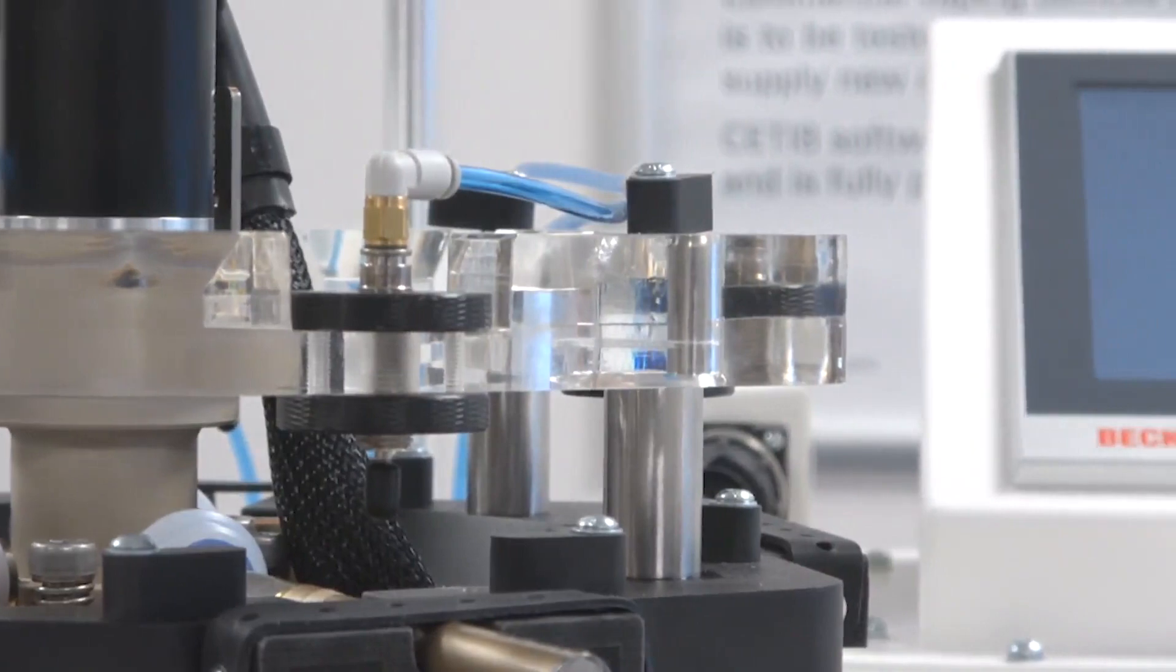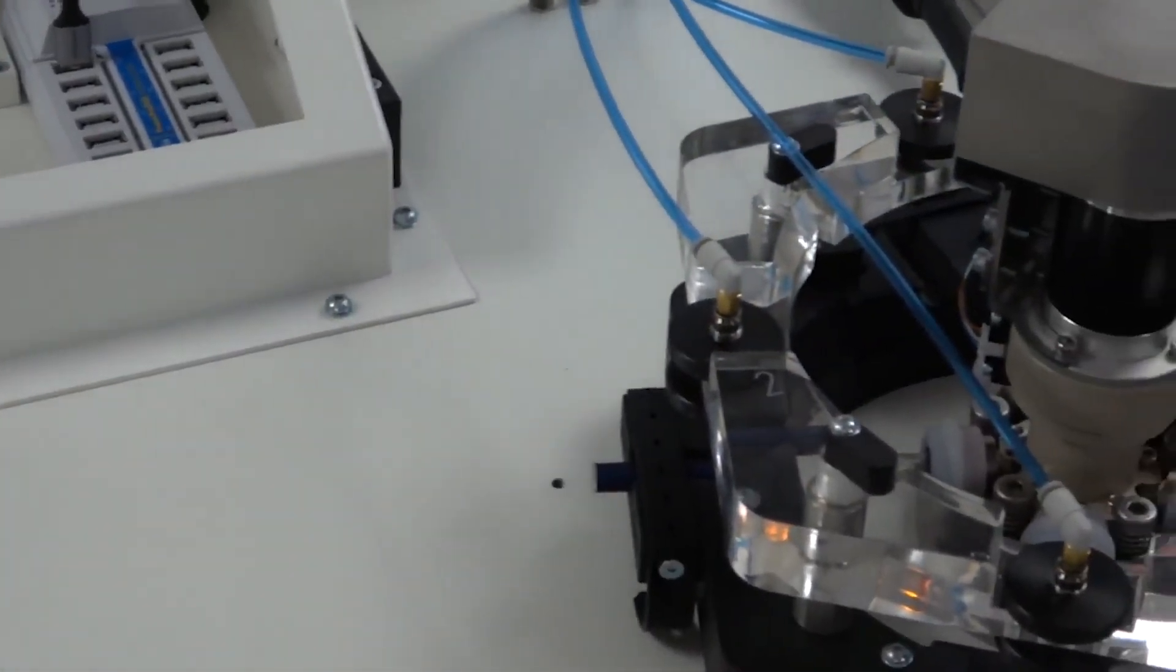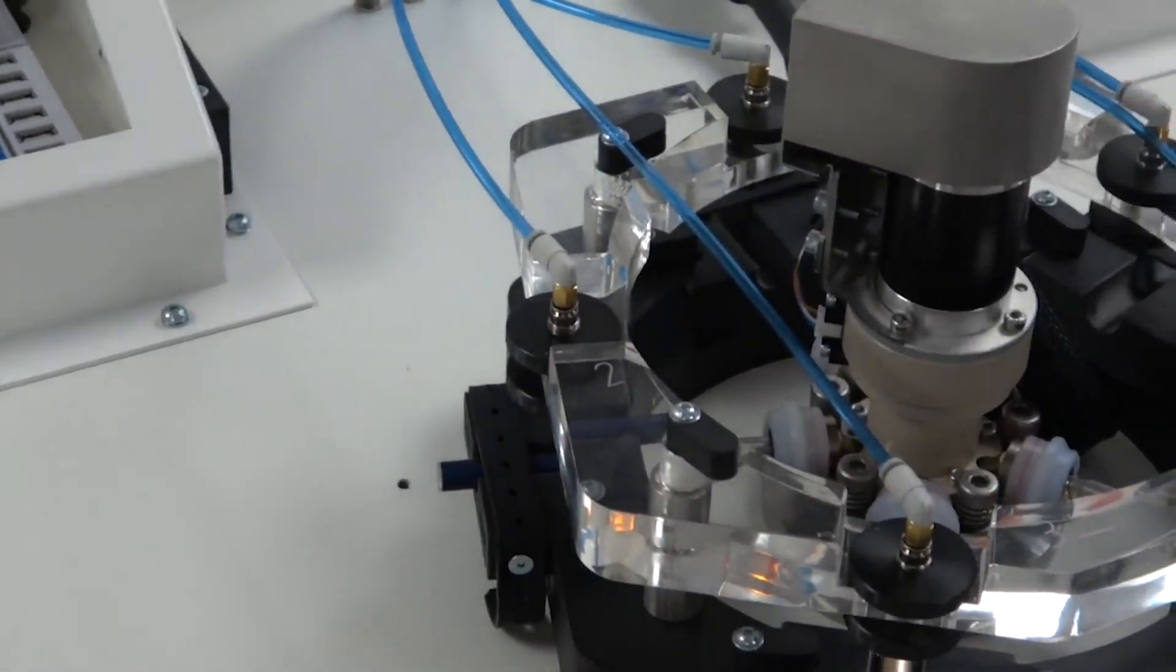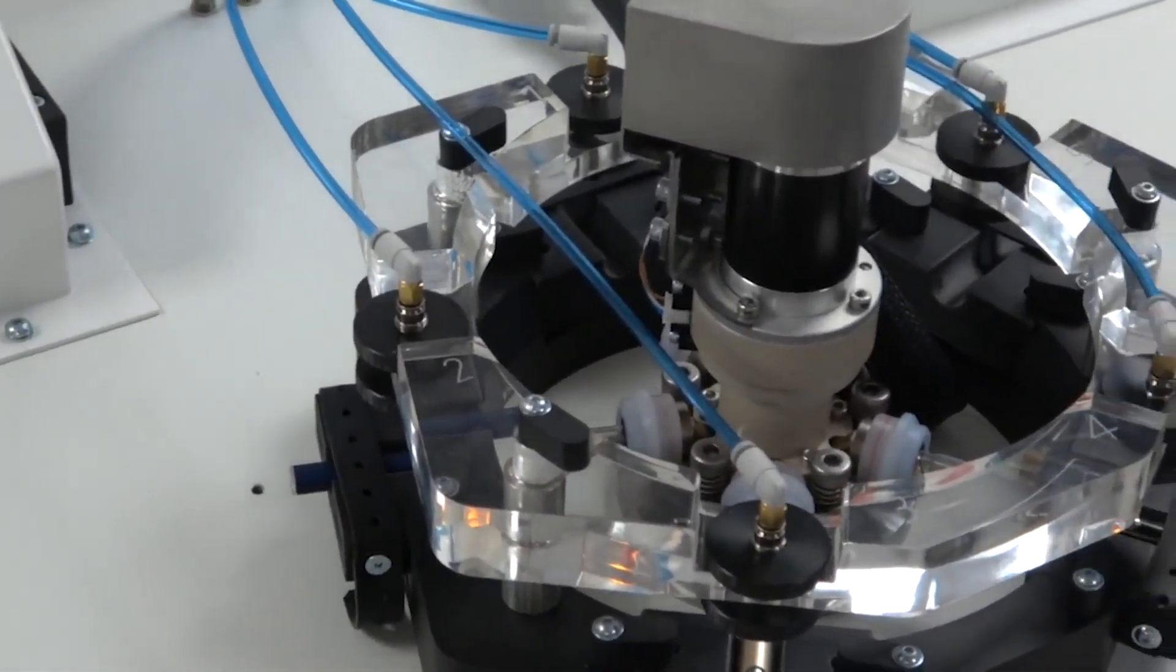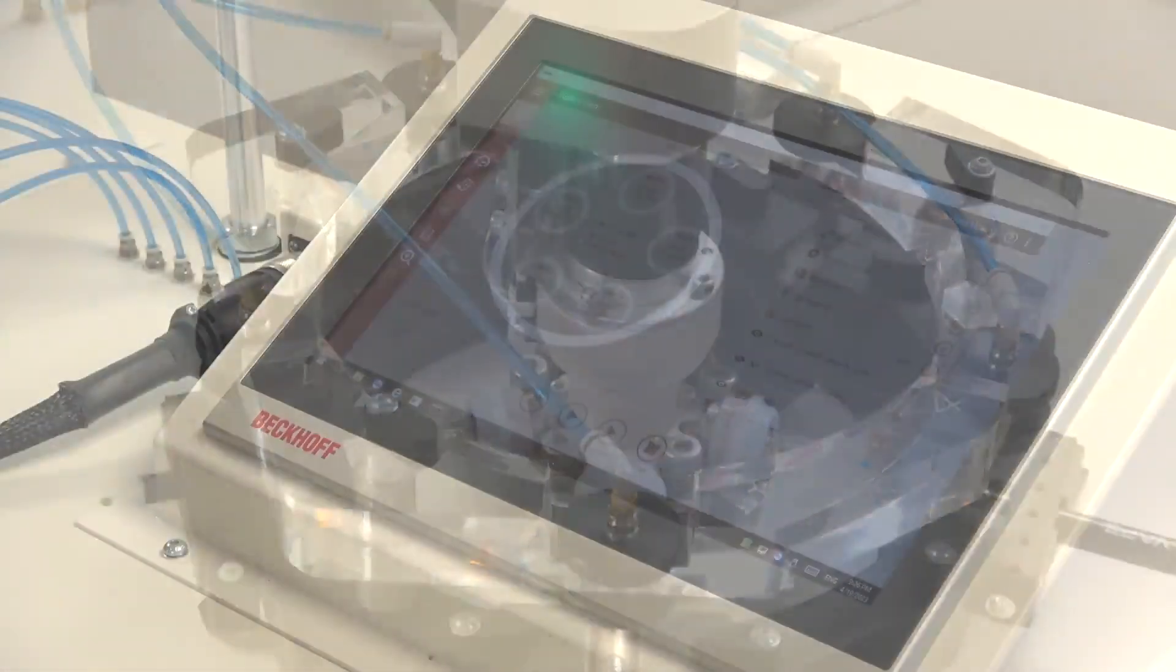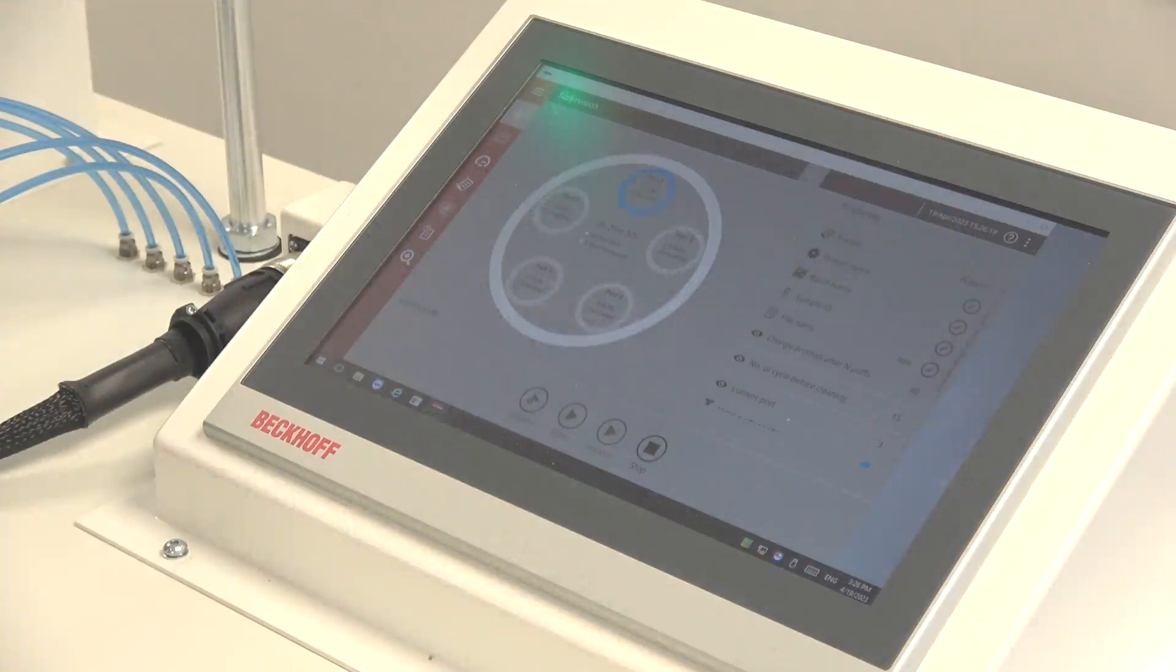The valve sits on a PEEK disc which is designed with a single orifice. The PEEK disc rotates based on the timing defined in the regime and aligns the respective port with the pump, allowing the suction from the pump to draw the aerosol from the product on the respective port on the valve.